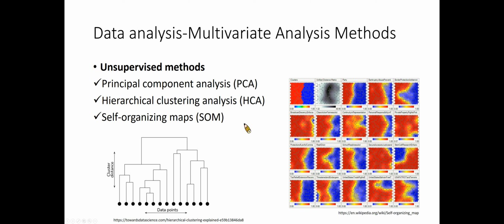Unsupervised methods are often applied to summarize the complex metabolomic data. They provide an effective way to detect data patterns that are correlated with experimental and/or biological variables. Principal component analysis is the most commonly used unsupervised method in metabolomic studies.